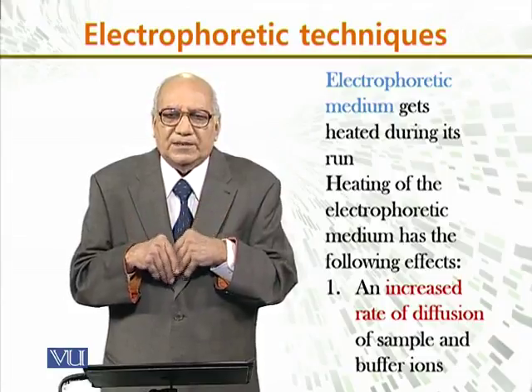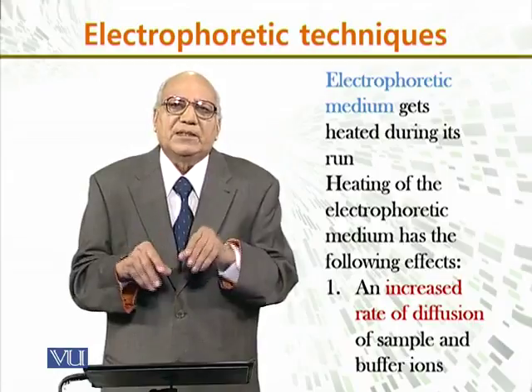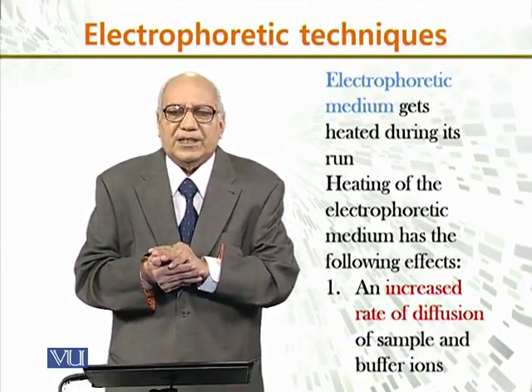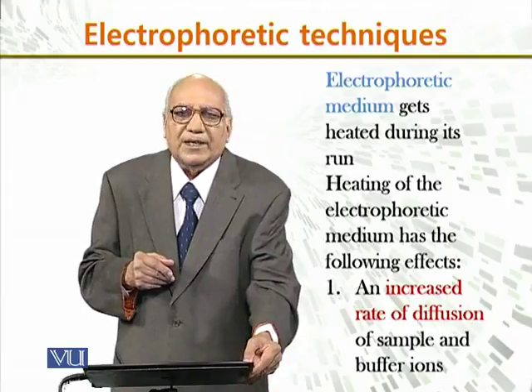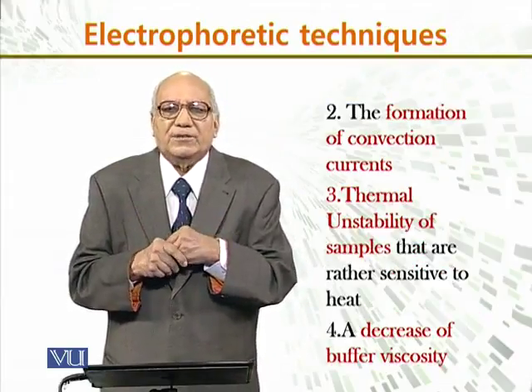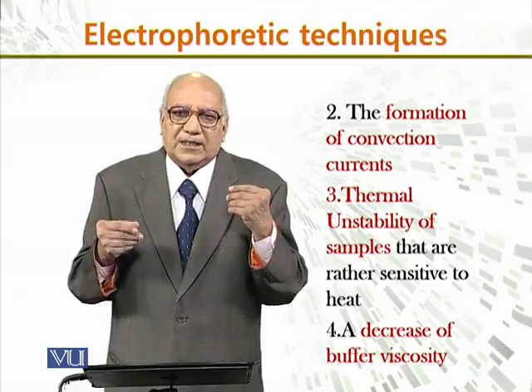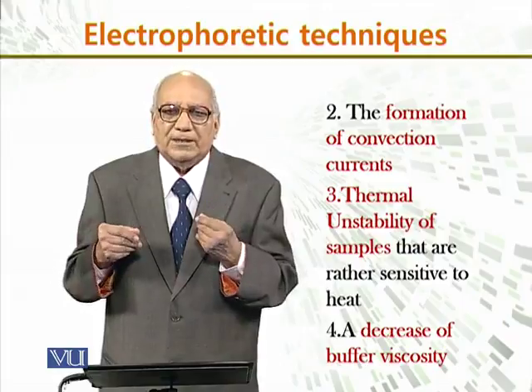Number one, an increased rate of diffusion of the sample and the buffer ions. Two, the formation of convection currents in the buffer.